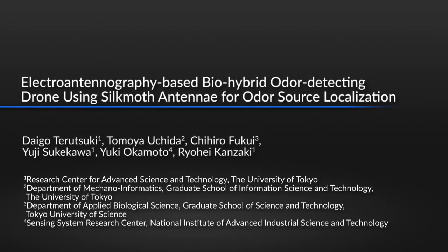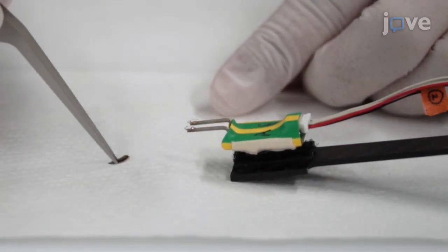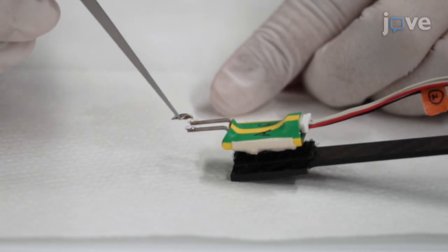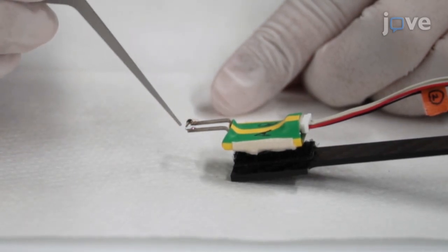The Biohybrid drone with the Silkmoth antenna can work as an efficient odorant molecule detection tool and a suitable flight platform for developing odor source localization algorithms. The main advantage is that the Biohybrid drone has sensor directivity towards odor sources because of equipping the sensor enclosure.